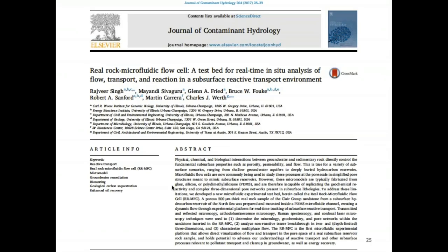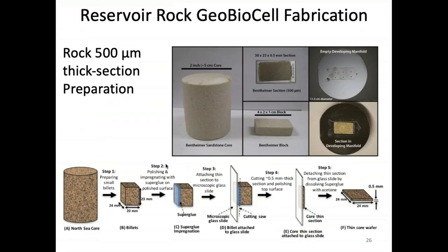So this is the paper we published, I think last year, about designing this new experimental setup, which would realistically simulate the subsurface conditions. What we have is a core from the North Sea, a real subsurface core, and we make it into a billet. Basically the process here is we cut out these small wafers, 500 micrometers thick.